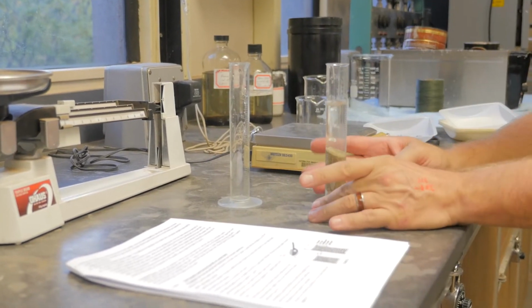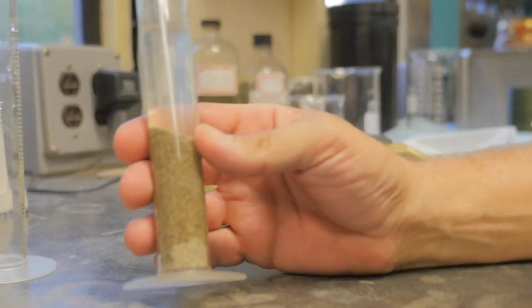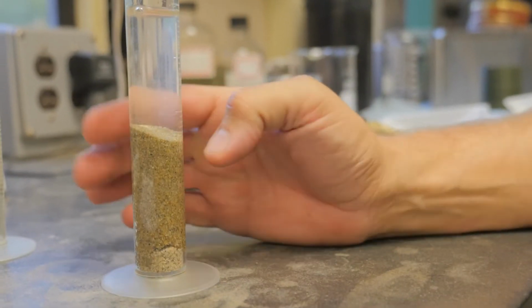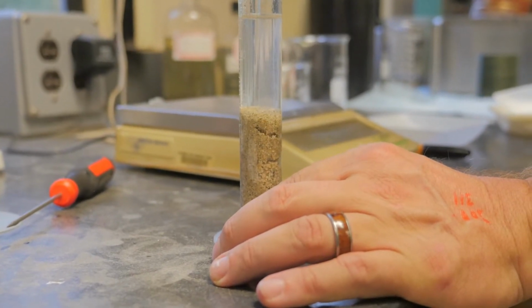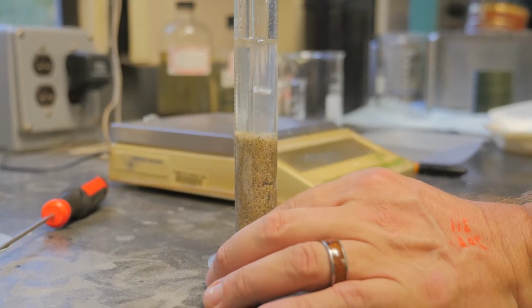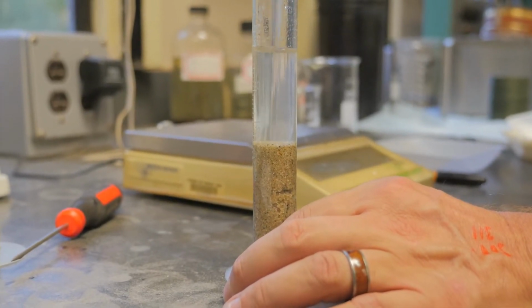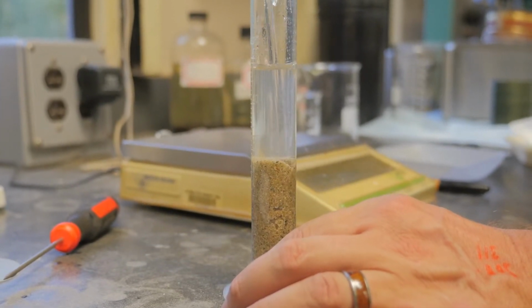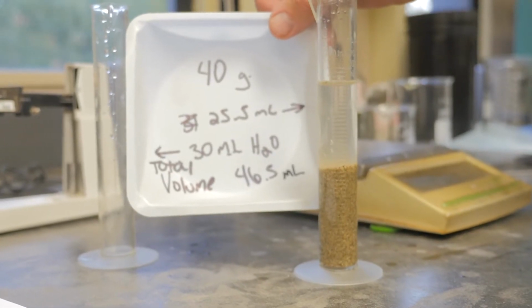I just wanted to point out that there was a moment where gas bubbles were trapped in the bottom. Just because there are pores in the sand and the ability for the water to get in doesn't mean that things can't get trapped down there. We literally had to get out the glass stirring rod and poke down in there to release the bubbles of atmosphere that were trapped. Always fun to observe things, think about what's happening, and then figure out how to fix it. From that, we'll go do the calculation up on the board.